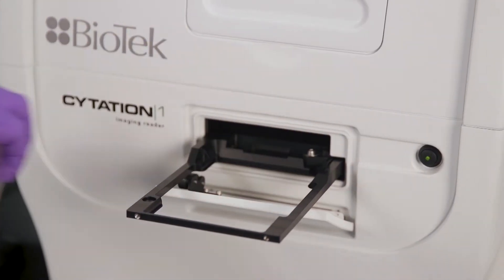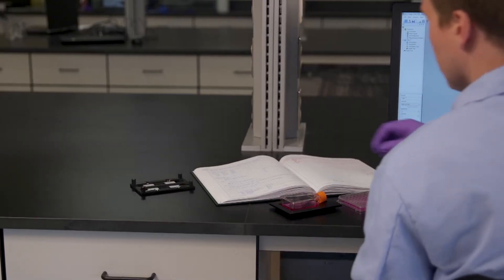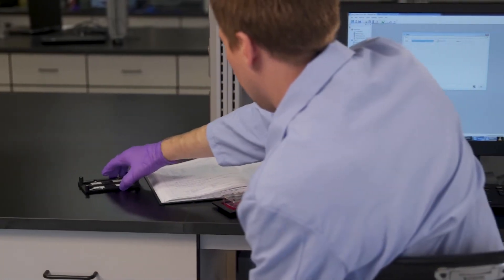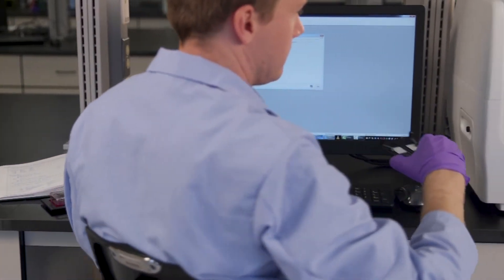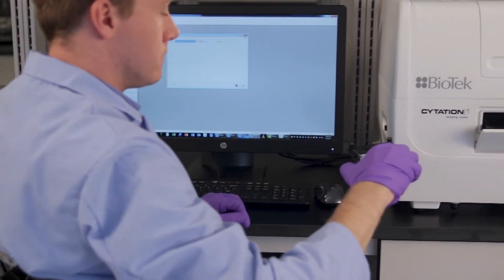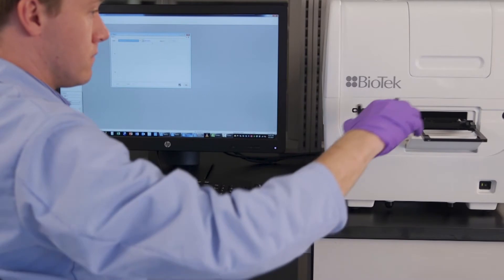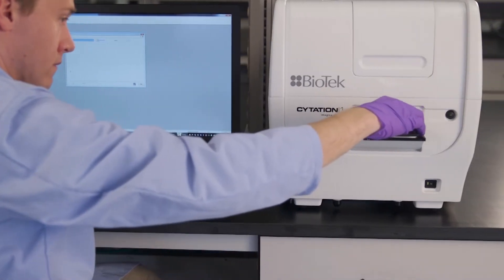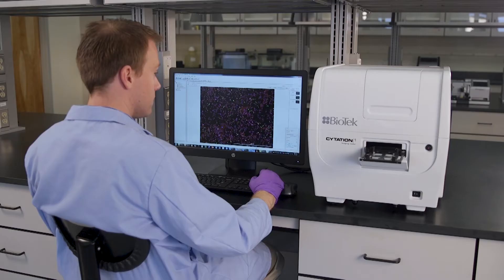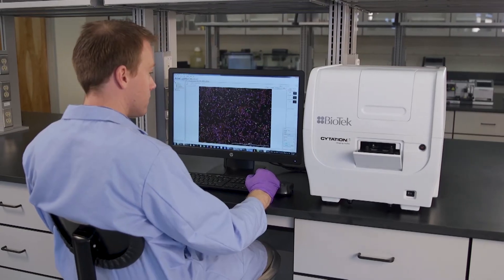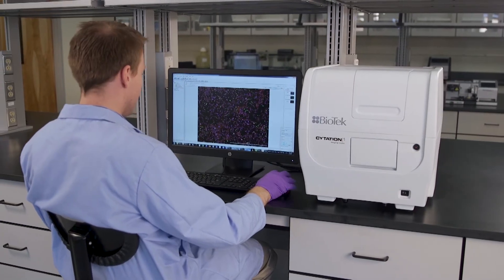Whether your workflow includes endpoint or kinetic cell counting and analysis, Biotech Citation and Gen5 software provide easy, rapid, and precise automated cell counting in microplates.